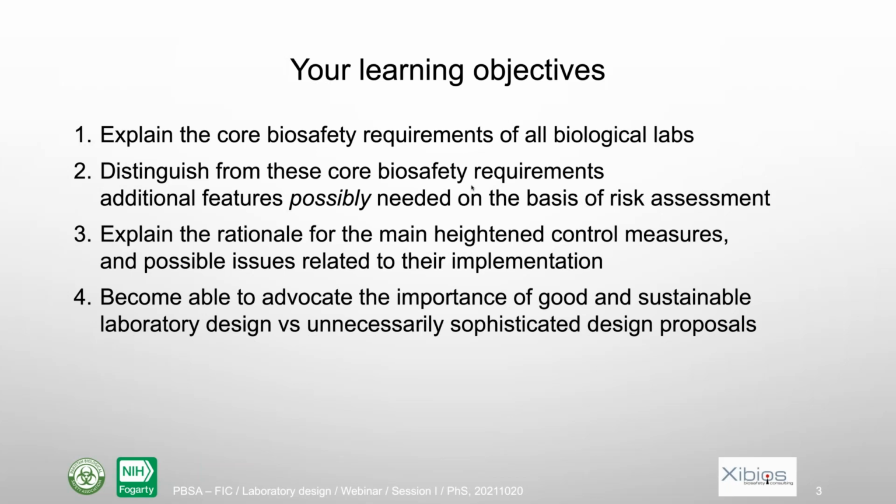And then also you should become able to advocate the importance of good and sustainable laboratory design versus possibly unnecessary sophisticated design proposals. If you deal with architects and engineers to build a new lab, they will always come up with some sophisticated measures and so on.